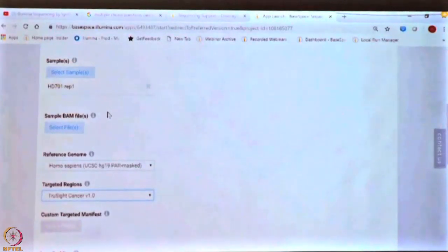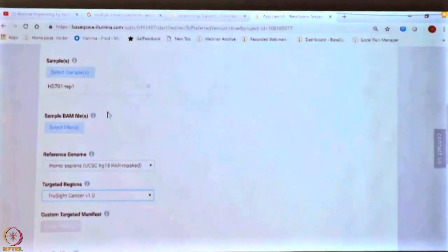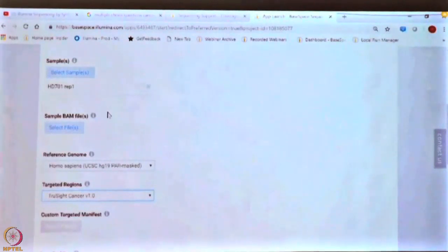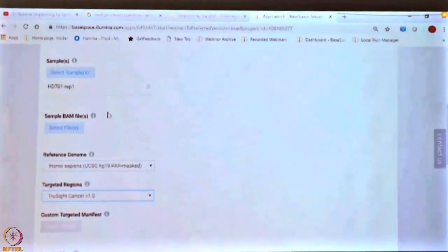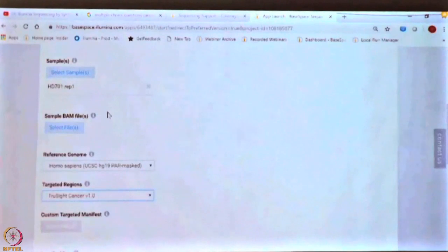In this case, as this is TruSight Cancer data, I will choose the TruSight Cancer version 1 region file. This will define for the application what regions it should look for variant calls in. This will significantly shorten the analysis time — otherwise the app may end up scanning the entire genome, resulting in extremely long analysis times and potentially false information from repetitive or homologous regions. The targeted files essentially help streamline your analysis.